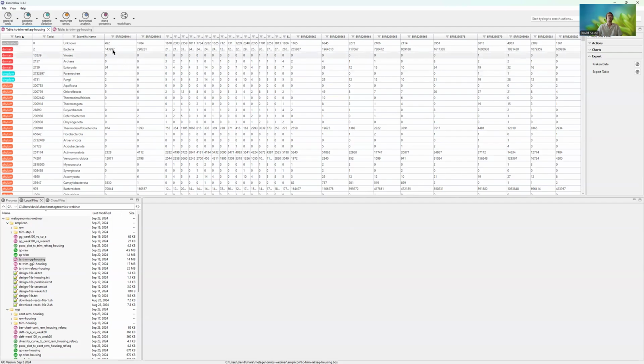What options do we have with this data? We can sort, filter. We can remove samples. Like if there's an outlier sample, we want to remove it. We can rename samples. We can extract sequences. So maybe we want to look at all the eukaryotes from my samples. I want to analyze them again or somewhere else. Maybe I want to assemble the data, the reads, or I want to do a gene finding or look at the functional potential or whatever.